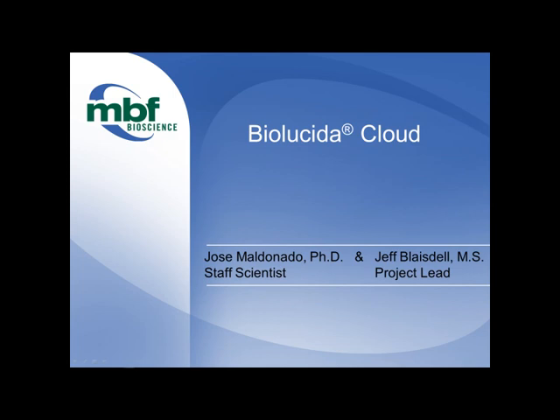My name is Jose Maldonado. As a staff scientist for MBF Bioscience, I have the opportunity to work closely with many of our customers, and a recurring theme among you has been the need to manage large amounts of imaging data between multiple workstations, multiple colleagues, and even multiple institutions. Today we'll be introducing a new product, Biolucida Cloud, to address just that need.